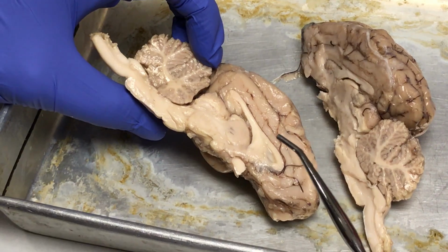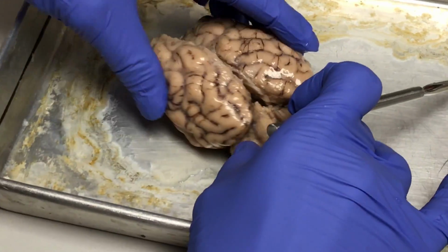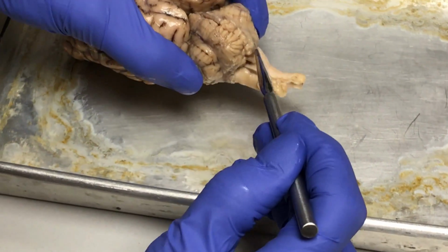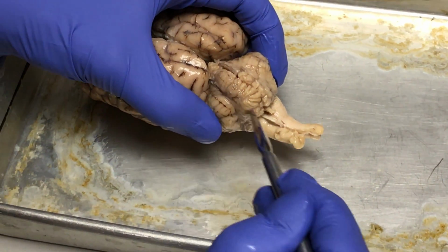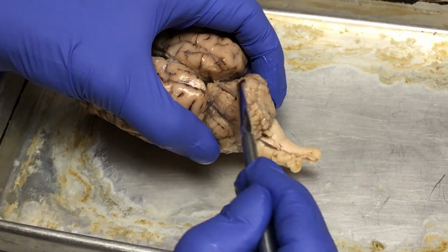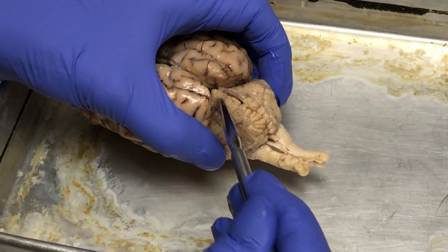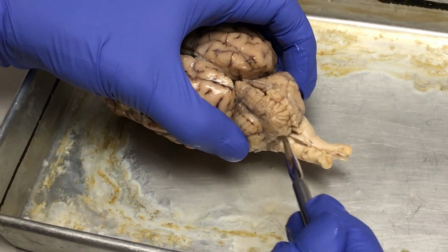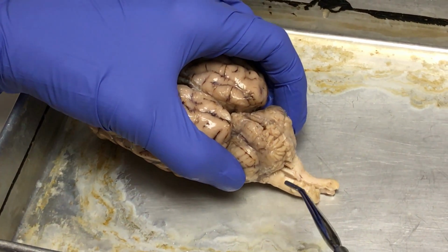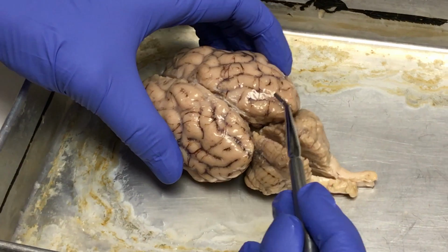Is that vermis on there? Yeah, actually, thank you. Forgot the vermis. Okay, so if you put the two sides together, you can see the vermis. It's this kind of strip of tissue here. It's about a half inch wide. And these little folds are the folia. So the vermis connects the two hemispheres. In the sheep brain, it's actually pretty wide. It's like about a third of their cerebellum is the vermis. Yeah, that looks pretty big. Compared to ours is smaller, right? Ours is smaller, yeah.